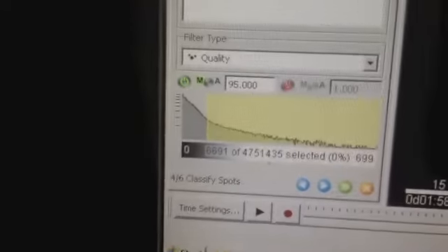Gives us a total of around about 6,500 dots, which is okay for a control. So this is a control cell. So we'll click next. It's now going to chug away.